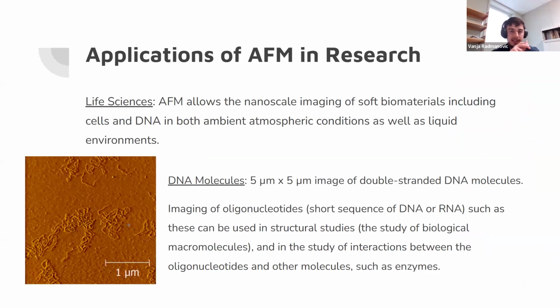So I want to discuss now the applications of atomic force microscopy in research, and we're going to focus on life sciences. So the main way it's useful here is AFM allows the nanoscale imaging of some soft biomaterials, including cells, DNA, and other biomolecules in both regular atmospheric conditions, as well as liquid environments, which is very interesting.